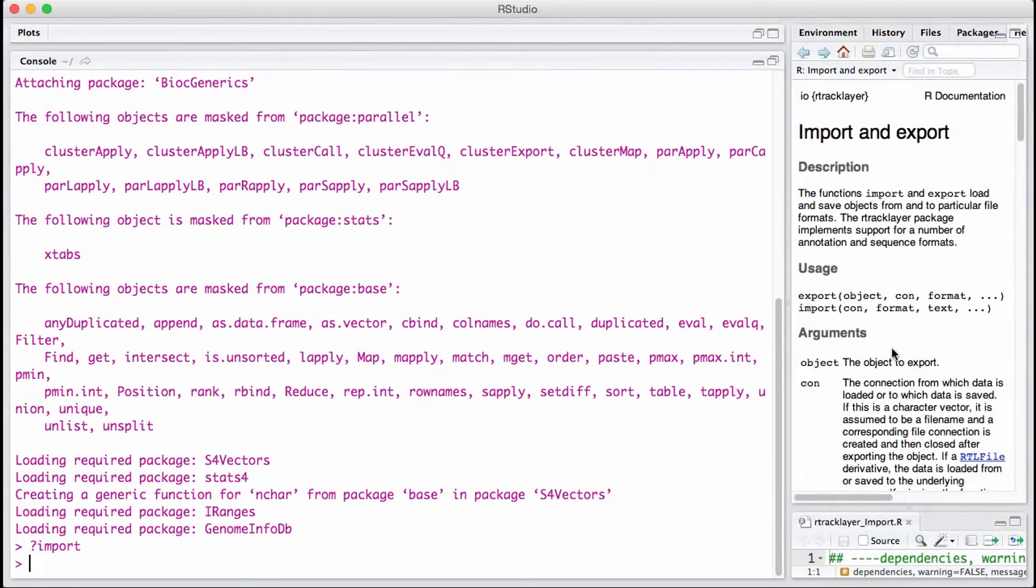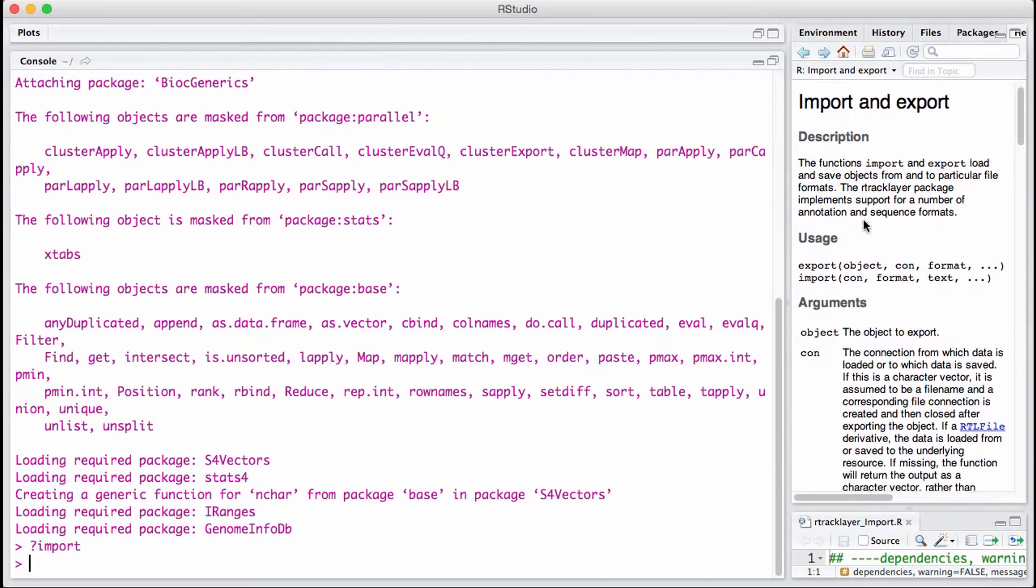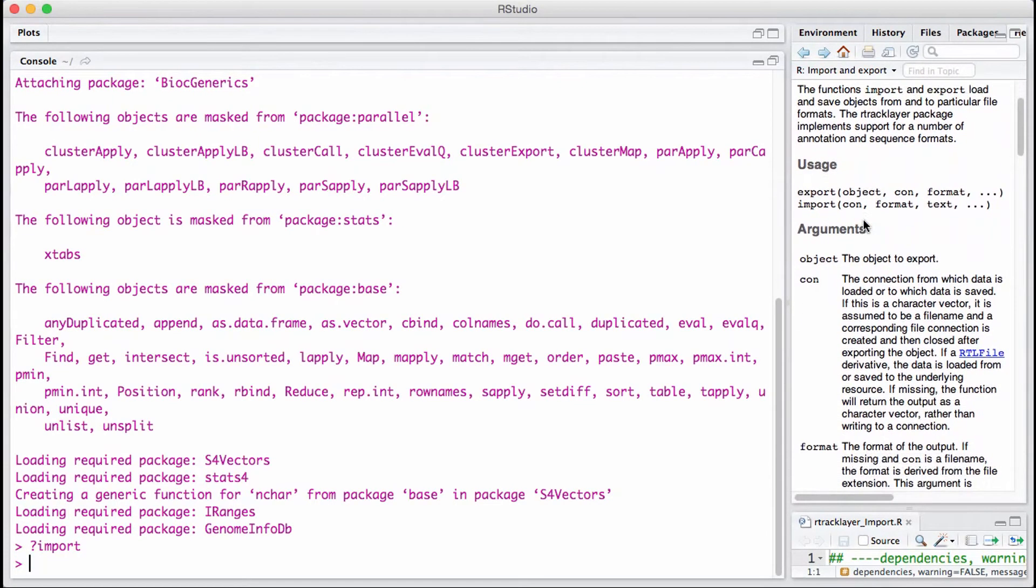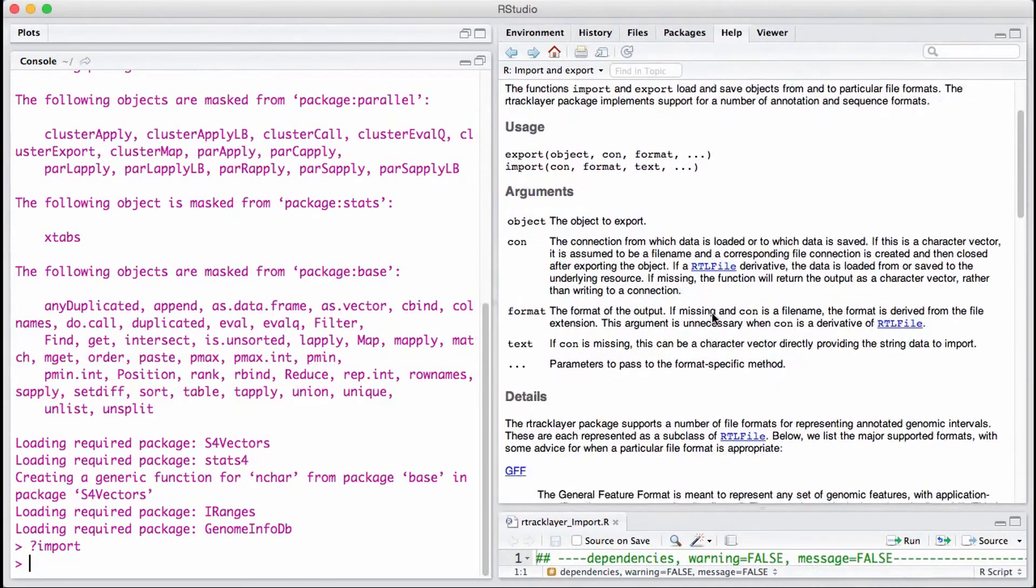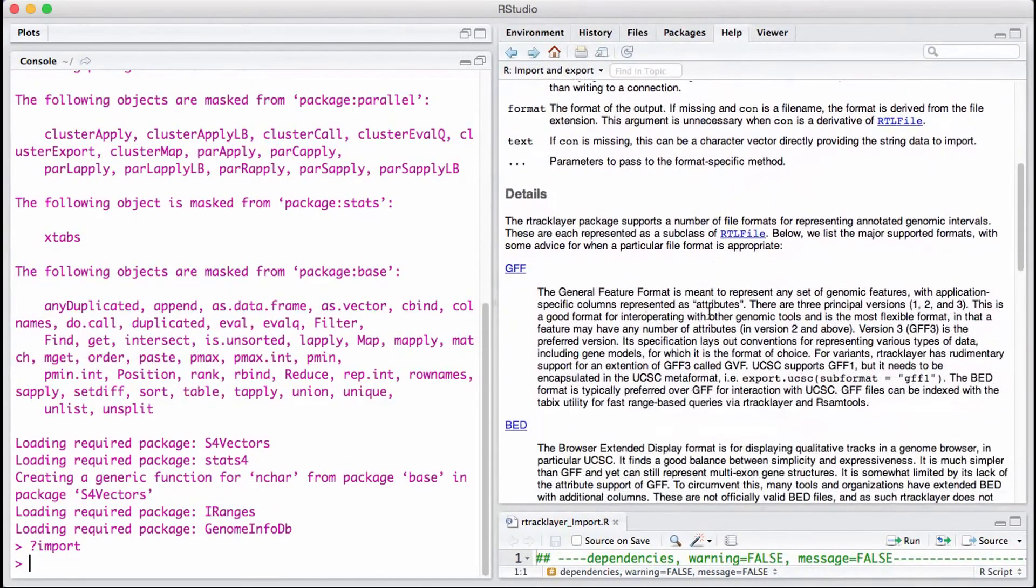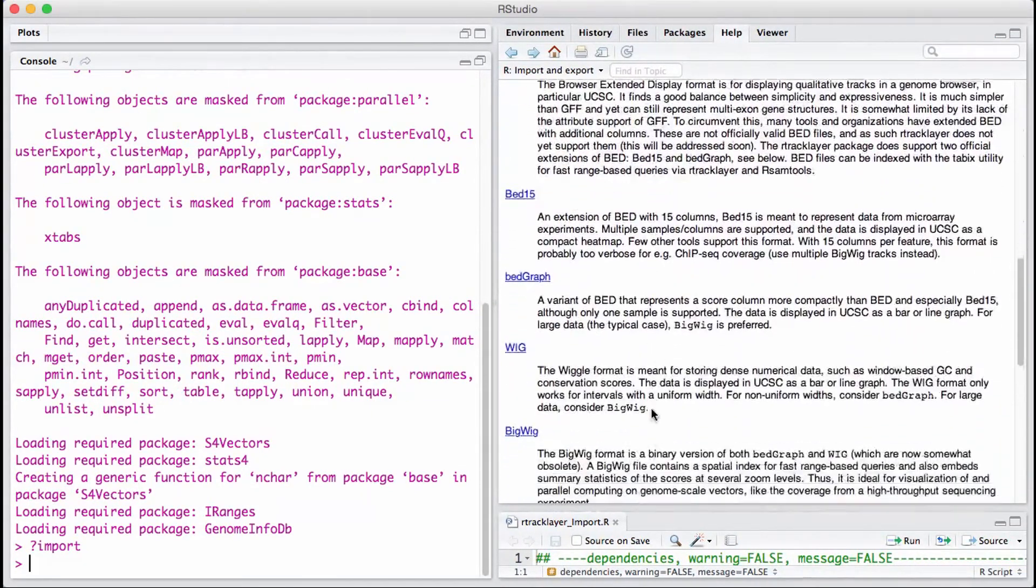As I scroll down, you can see a little bit of the basics of what I just told you. It also explains what kind of files they can read: BED, GFF, et cetera.